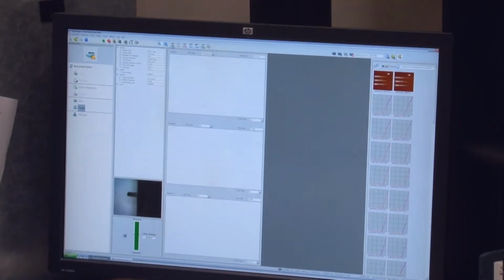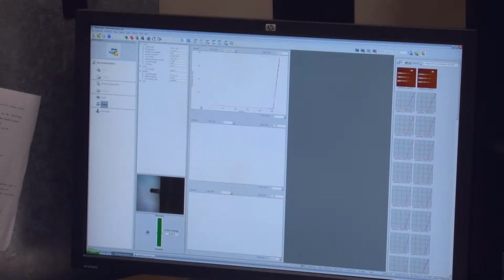I'm going to collect a single ramp. This is a typical force curve where we see a signal response in the area of contact. And in this area, we want to calculate the deflection sensitivity. So I'll focus on an area that contains only this linear response and calculate the slope.